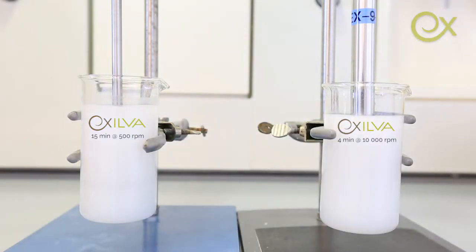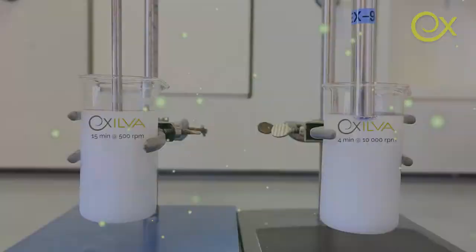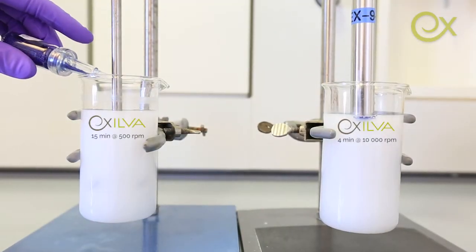In this test, the low shear stirrer is running for 15 minutes at 500 RPM, while the high shear stirrer is running for 4 minutes at 10,000 RPM. The dispersion on the left visually looks good.